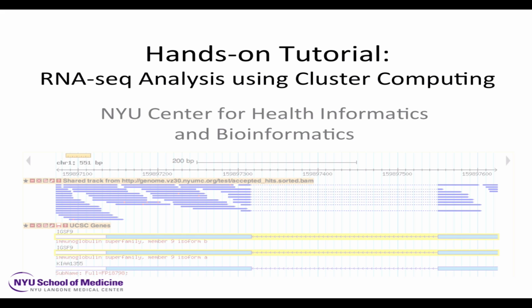So actually the price for PolyA stranded and non-stranded is the same, which is why we completely switched to stranded. For ribodepletion, the method is exclusively stranded, because since you're sequencing the whole transcriptome, otherwise it's really messy to map things back to the transcriptome or to the genome.